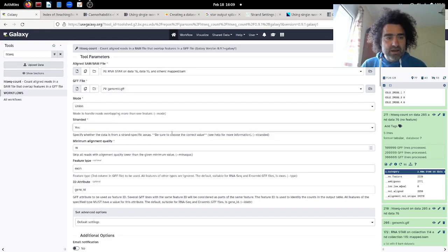Now I did some experimentation, and when I put stranded yes, I really got very few reads, so this was clearly wrong. And when I put stranded equals reverse, then things became good.